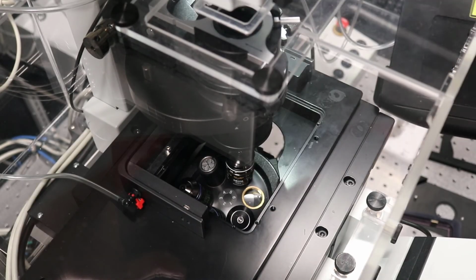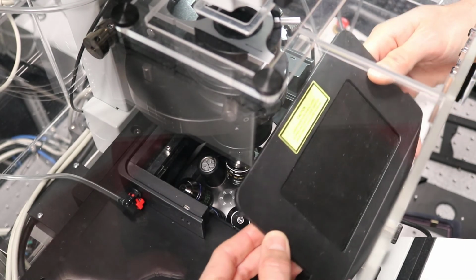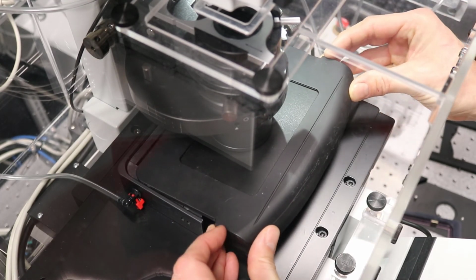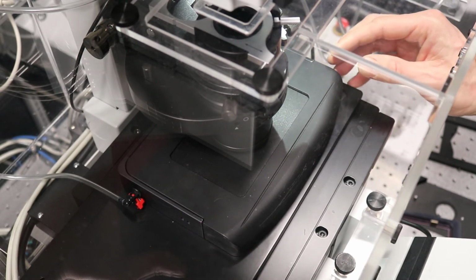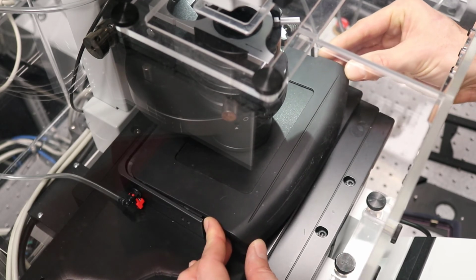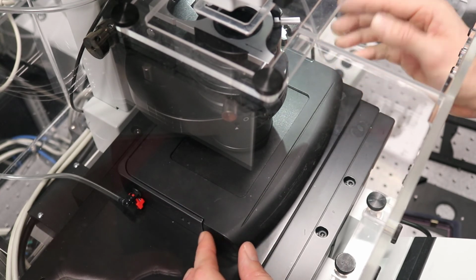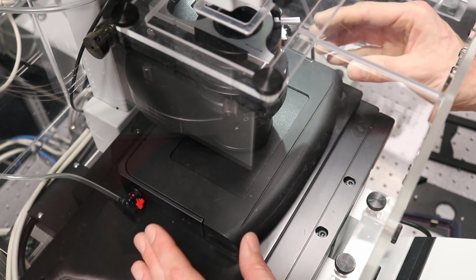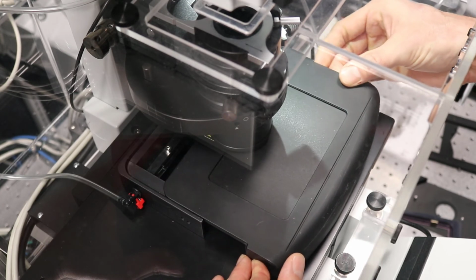When you need the system for TIRF illumination and you're using the lasers, you should put in this laser safety box, and once it is in the correct position, then the laser is ready to be operated. If you don't remember this, the system would not work for you. And you also use this piece for CO2 coverage. So when you use the system for incubation, you also need to cover the slides or the samples.